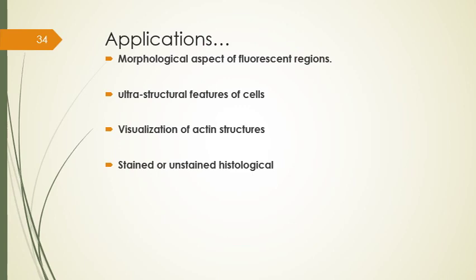The ultrastructural features of a cell, such as microtubules and cytoplasmic granules, can easily be visible through DIC. When this microscopy is enhanced with video techniques, it enables us to visualize various structures like actin that are actually below the resolution of the microscope. Similarly, DIC can be used with stained or unstained specimens, and then it can provide additional useful information.